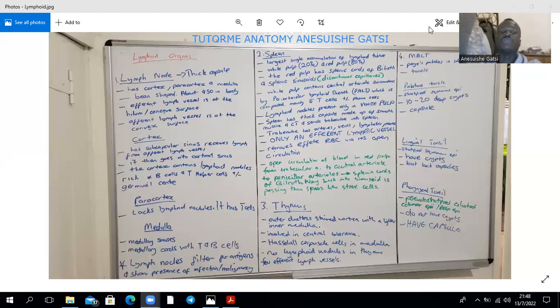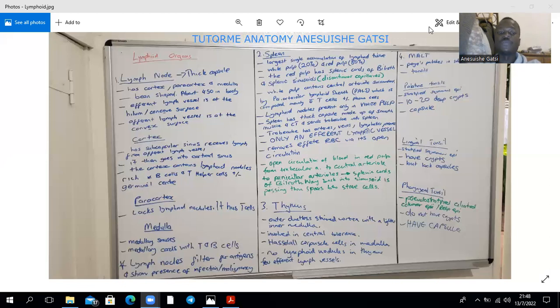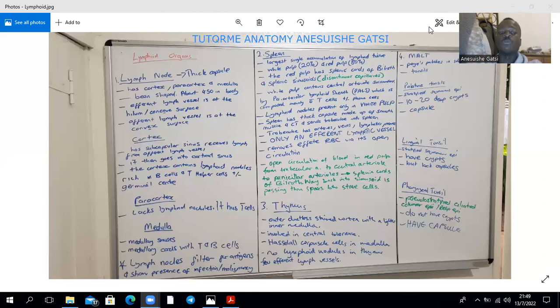The cortex contains lymphoid nodules, which are going to be regions of B cells as well as T helper cells, plus or minus the germinal center within the lymphoid nodule. The paracortex, or the deep cortex, is unnodular — it lacks the lymphoid nodules — and it has T cells rather. The medulla will have medullary sinuses and medullary cords, which have T and B cells. The lymph nodes will filter for antigens and show the presence of infection and malignancy by swelling.